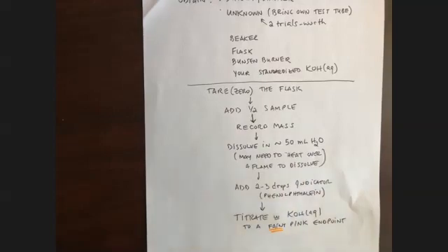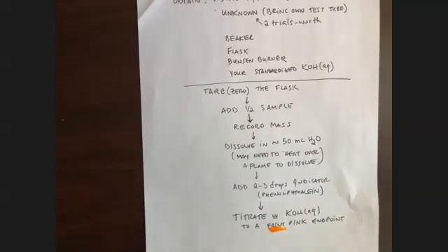Now you have your KOH in a burette. Of course, you condition the burette, you fill it with your KOH, you make sure there's no bubbles in there. And we're going to use that KOH to titrate our unknown acid to a faint pink endpoint. Remember that? Right.